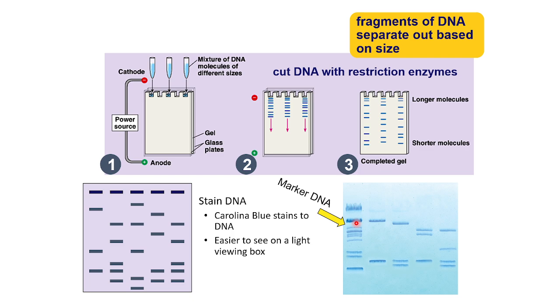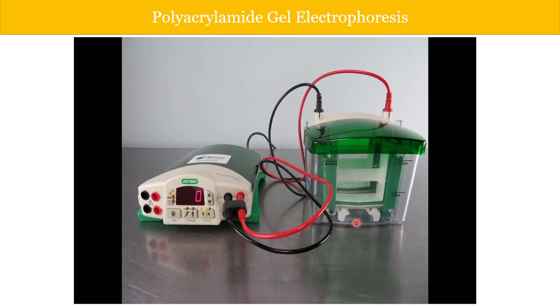That gives you an indication of the correctness of your cut size, or the size of the DNA that you want to achieve. So it's a reference as such. Okay, now, yeah, both are the same. So the ladder and the marker are both the same.